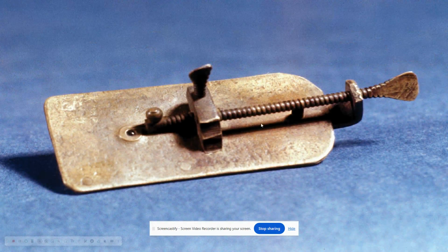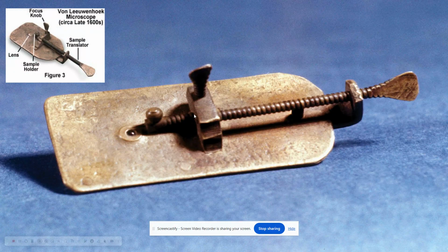Take a look at this picture, and before you proceed with the video, pause and try to think about what this could be. Hopefully you thought about this. This is actually a microscope. It's one of the first microscopes created by Anton van Leeuwenhoek. Basically, it was a way to examine the cellular world.